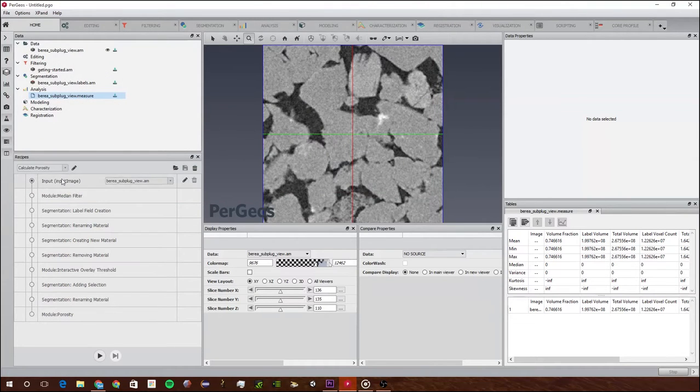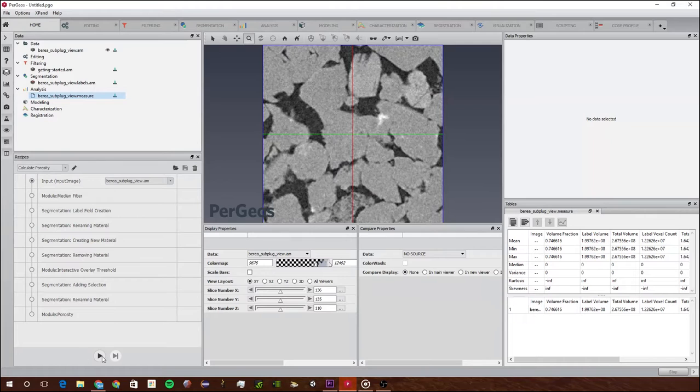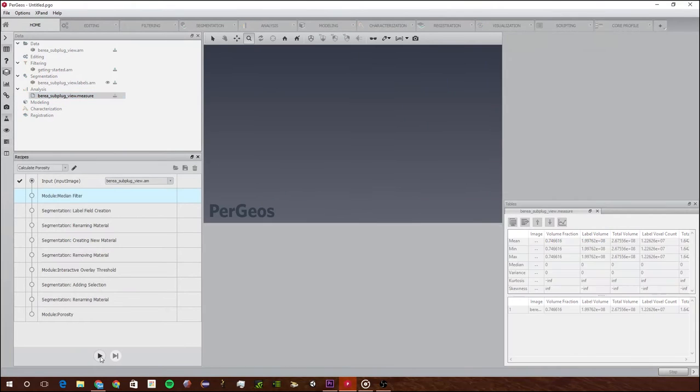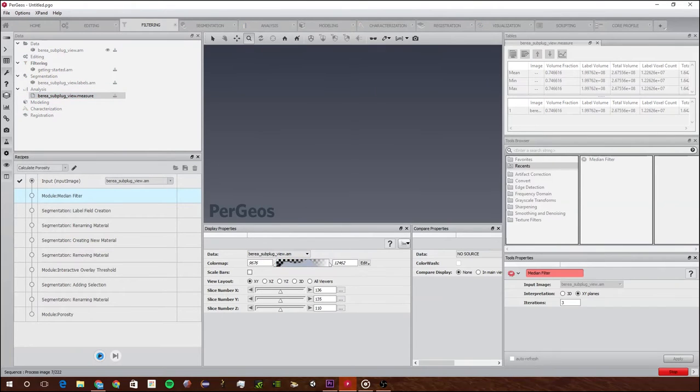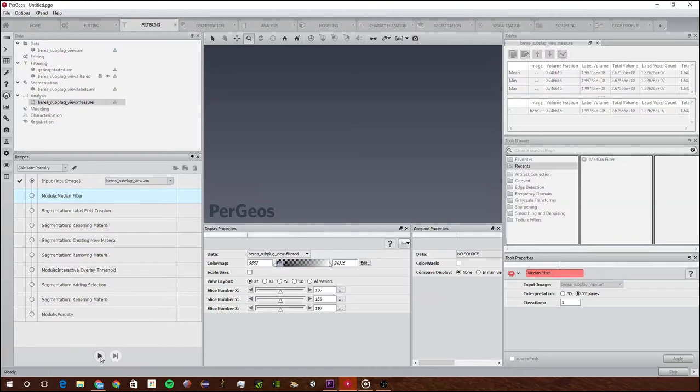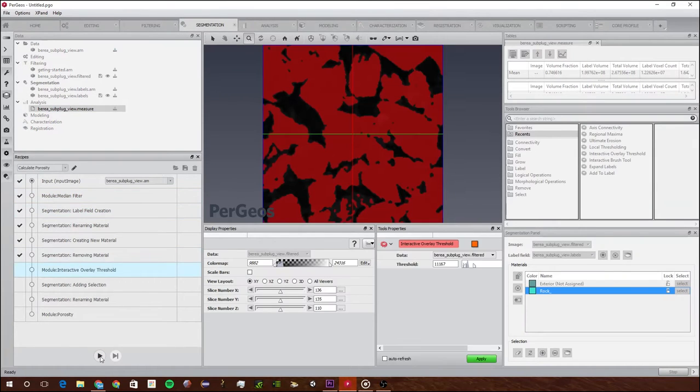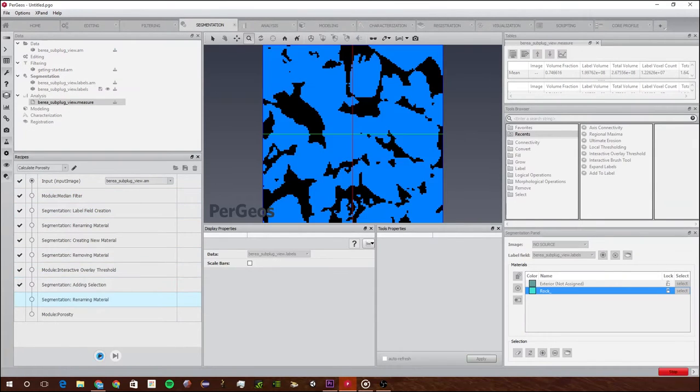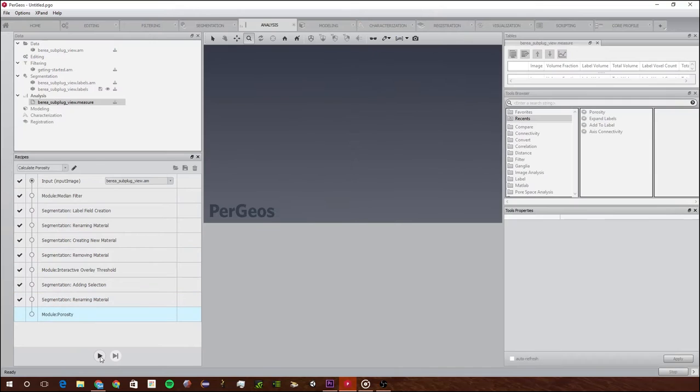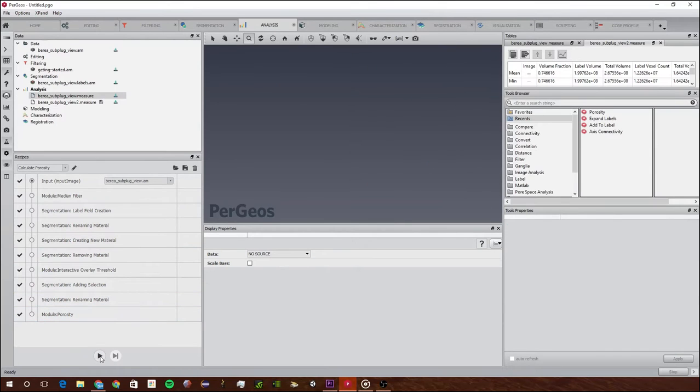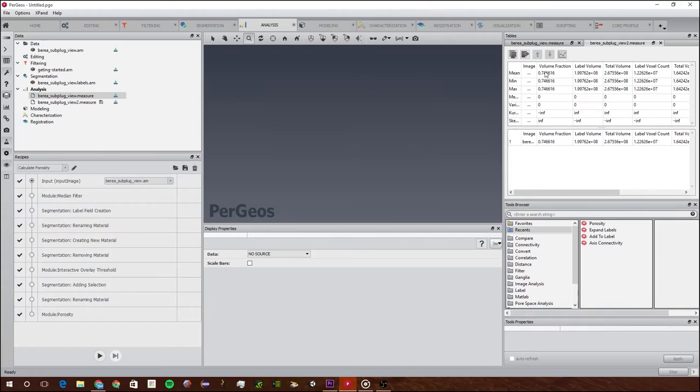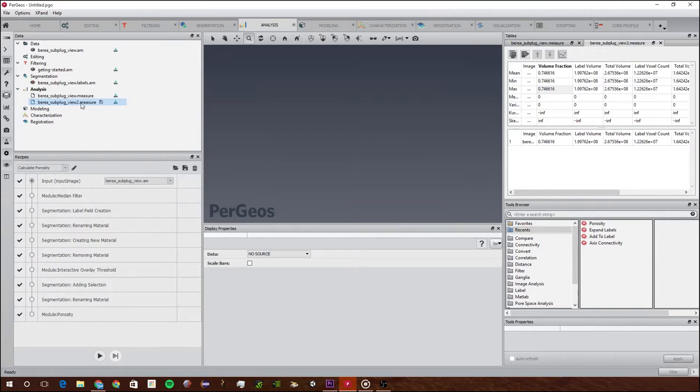Now that I have saved it, I'm going to just run it and show you guys what it does. To run it you just click this one button. It will calculate all of these and just go through all of them without doing anything else. It's done and we can see the volume. It's created a new one, this Berea subplug view 2.